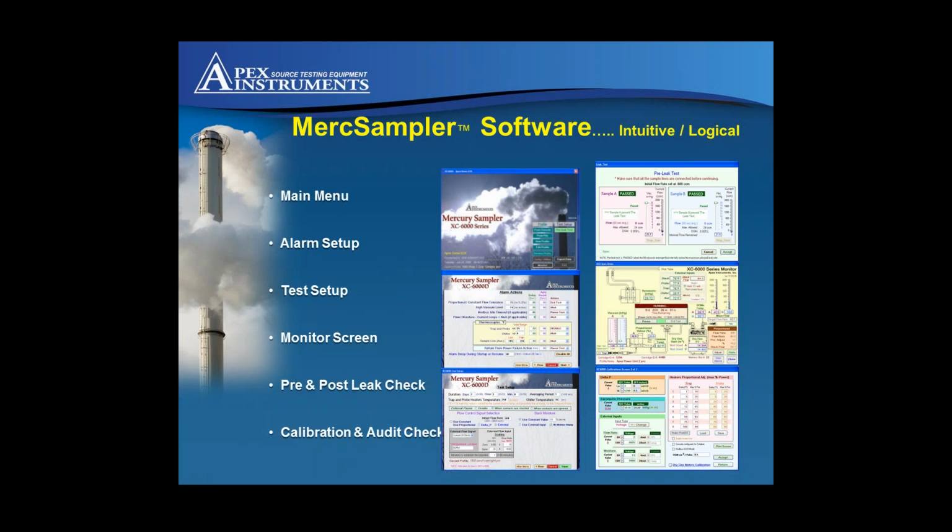Okay. And also for identification and monitoring plan on your sample flow meters, your dual meters, do you have separate identifications for those? Okay, I think I understood what you're saying. Yeah, the mechanical gas meters internally each have their own serial number, and that's also in the data. That will also be in the data exported, and it's also in the data for the quarterly audit that's produced also. Okay, that's what I was looking for.